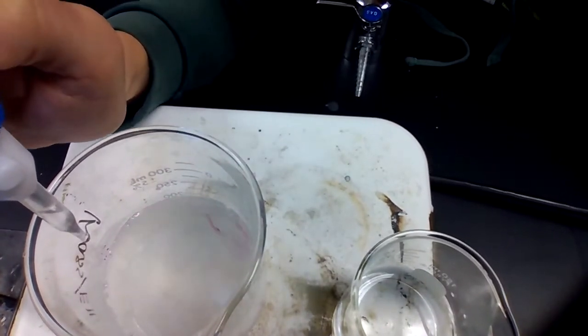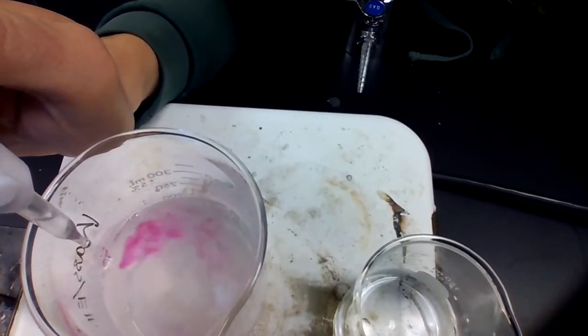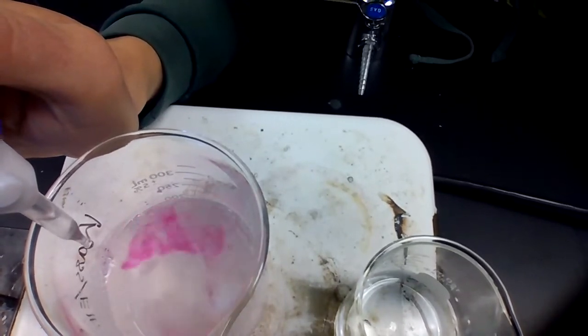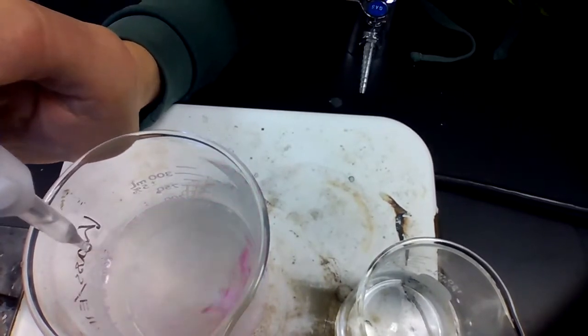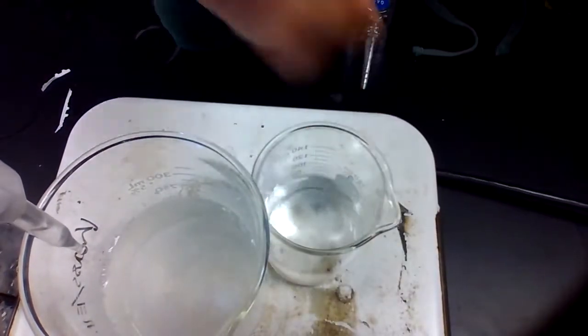Now we are getting close because you see that pink lingering a little bit more. And as soon as I see a difference in a color of these 2 solutions, I'm done.